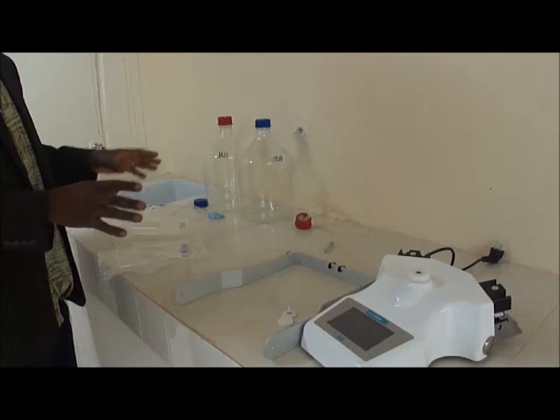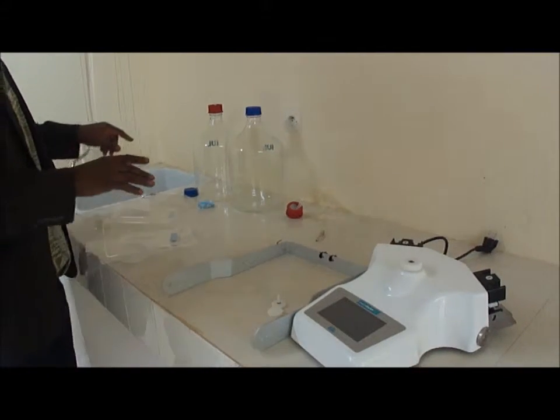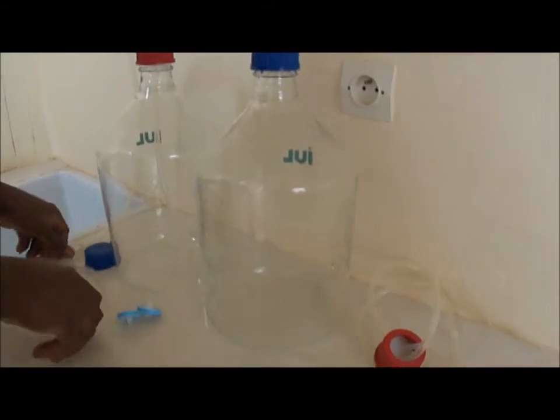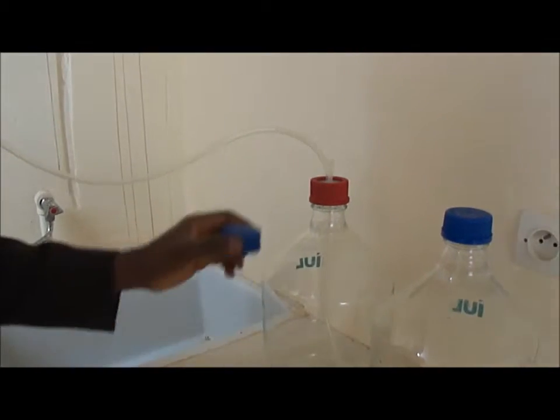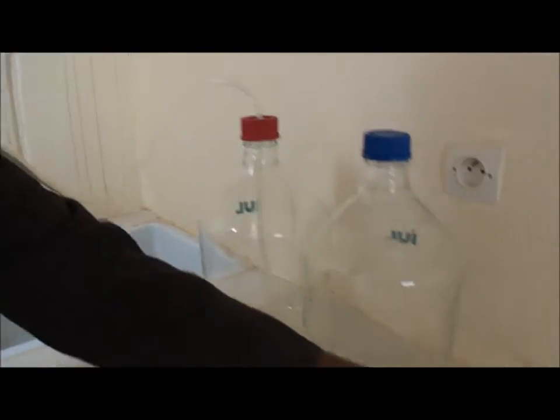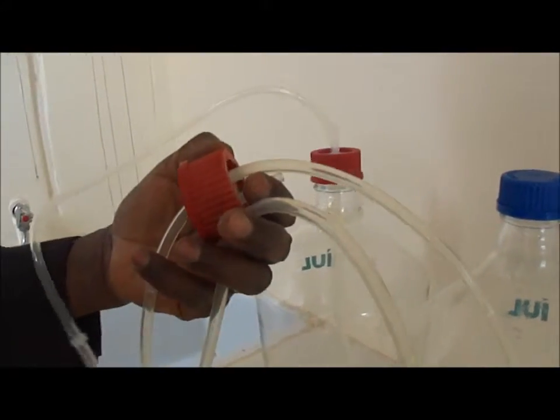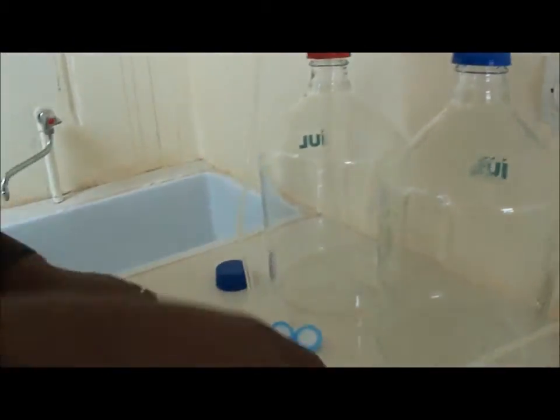When you receive the equipment, it comes in three main sets. The first set is constituted by the two bottles, each of which will be connected by a piping system that you see here, passing through the plug. The normal plug with which the bottle comes is this one, the blue one, but you have also with it this system of connection through the plug. You have the pipes passing and ended by a nozzle that you see here. We will show in a few minutes how to mount all this system.